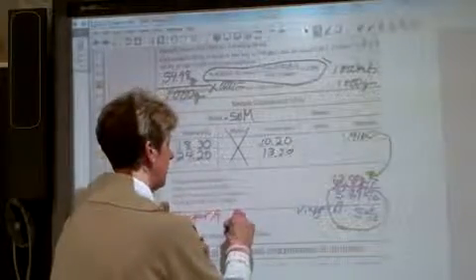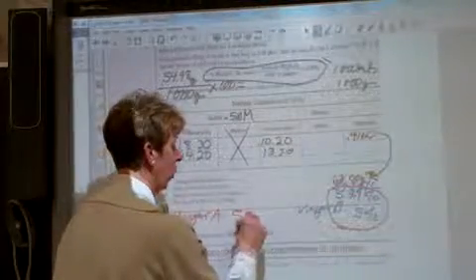Those of you with vinegar A, okay, you were using Festival's Flavorite vinegar. I always use generic. And it was 5.1% vinegar. Vinegars are not all the same. And again, this is what we were able to calculate. So what else do you need to do in order to finish up lab 21 or 22?